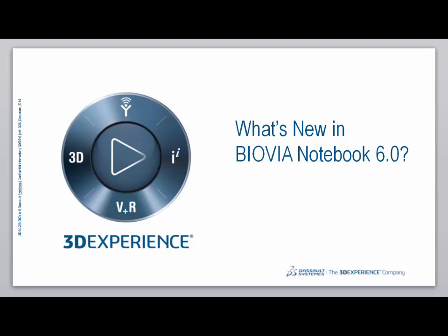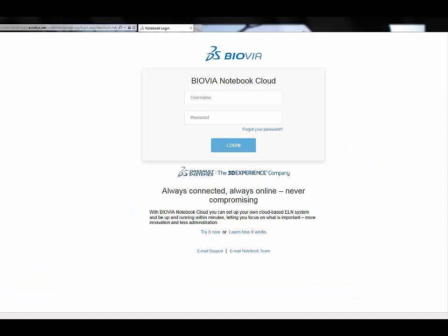This is an introduction video for current users of the system, rather than a training video for new users. The aim is to give you an overview of the new interface and some of the features that will be available in the 6.0 release.